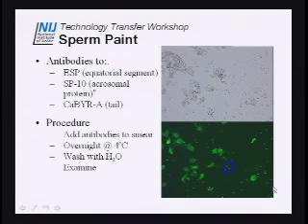Now, one thing about magnification: when you drop down from a 40X to a 20X objective, you don't double your search area, you quadruple it. So now you can search 4 times the area with a 20X objective than you could with a 40X objective. This has the capability of cutting down your searches, and in my opinion, it gives you more confidence in your identifications or in your negatives.